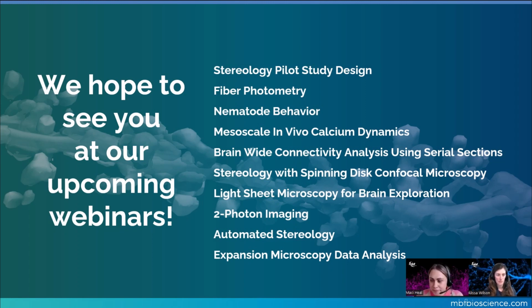That's a very brief overview of the differences, and we'd be happy to chat more about what you're doing and give suggestions. We have several neuroscientists on staff as part of our tech support team and our product management team. Especially if you're exploring a certain question and considering using stereology versus an automatic cell detection method, we would be happy to consult with you. Definitely.